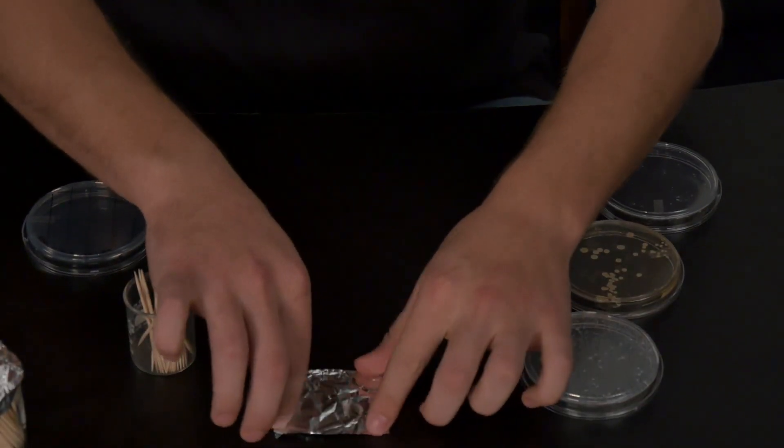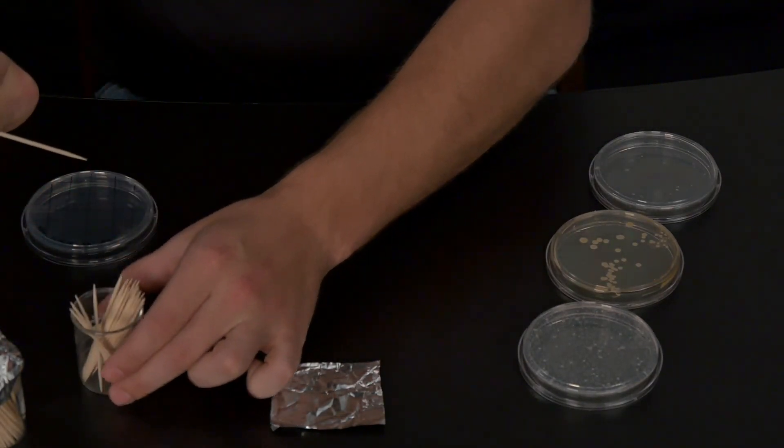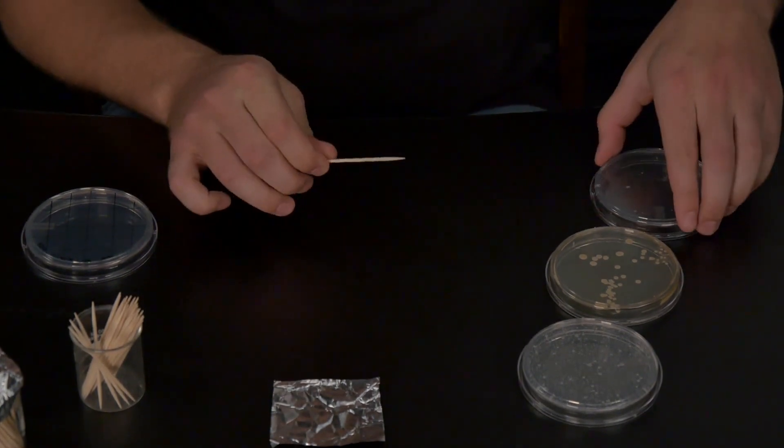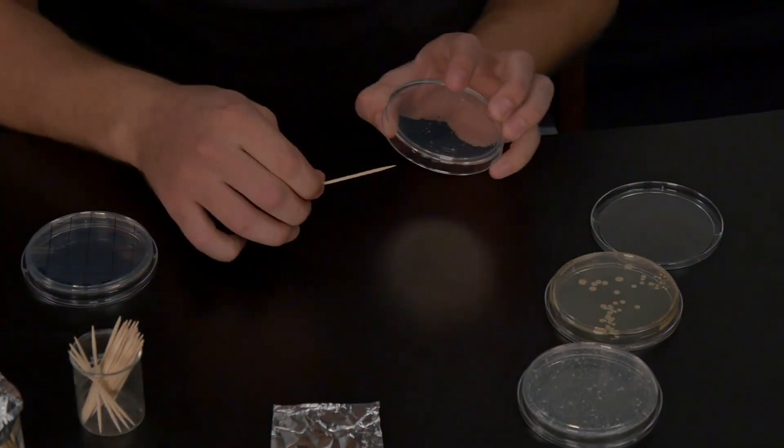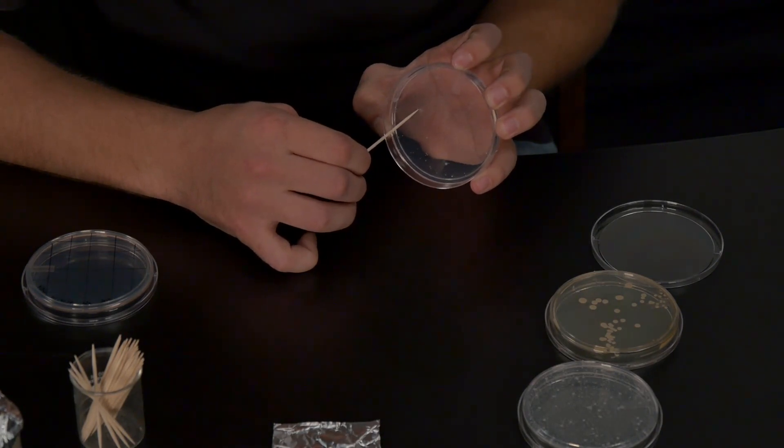Take a sterile toothpick from its container, being careful not to touch one of the tips of the toothpick. Take one of the plates from the serial dilution where your bacteria have already been growing, and choose a bacterial colony that seems to be spaced farther apart from others.